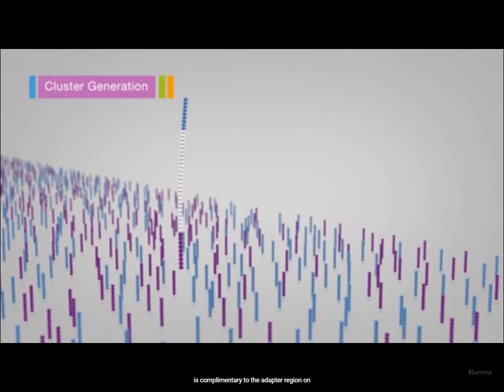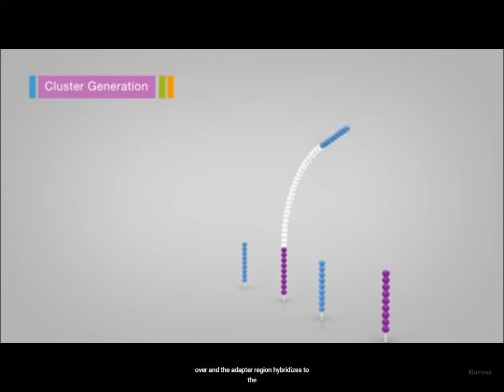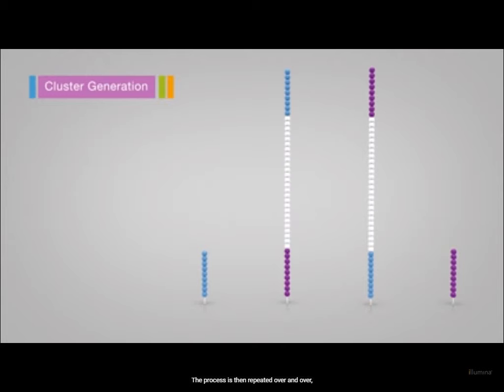This in situ amplification is a very common step in almost all of the massively parallel sequencers. There's a variety of different, say, bridge amplification methods and others that are used for making a whole bazillion copies of a particular strand that hybridizes with a particular location. Obviously, we don't want to try sequencing a single molecule if we can avoid that. So getting a molecule by itself and then making a bazillion copies of it in situ really helps us with the sequencing process. This cluster generation is essentially making a whole bunch of copies of the two strands that have flashed down at this particular point.